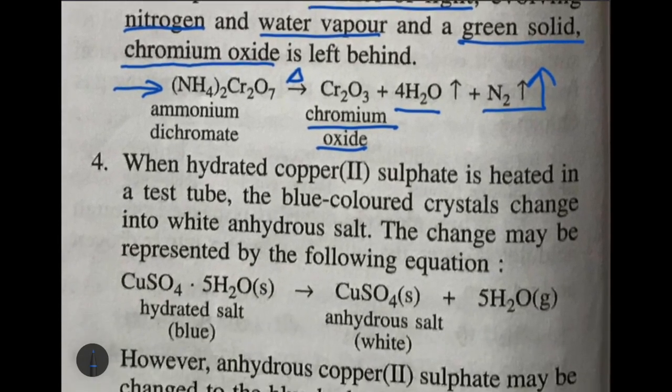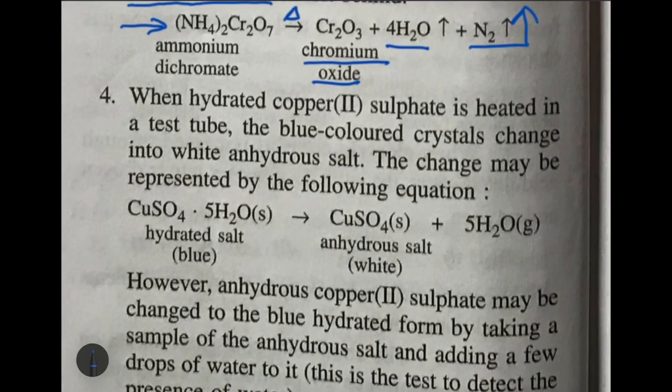Now moving on to the fourth experiment. When hydrated copper 2 sulfate, hydrated means it has some amount of water in it. Okay, so hydrated copper sulfate is blue in color due to the presence of a few molecules of water.